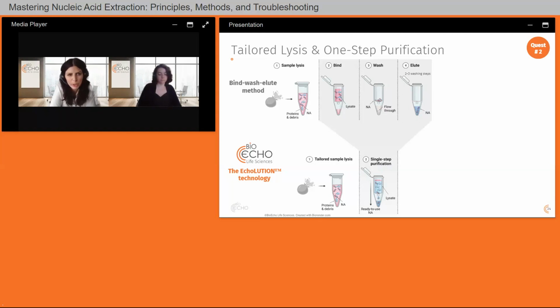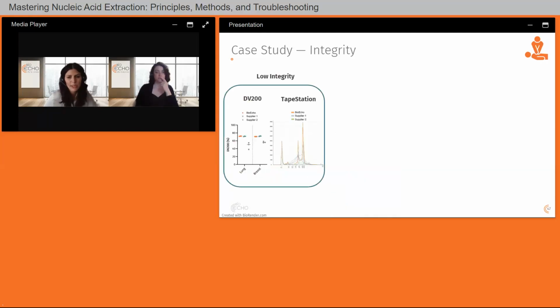Because usually people, when working with RNA, for instance, expect the textbook high RIN values. And I think that's not feasible with FFPE, because how the FFPE sample is handled completely ruins our RIN values, because it's cooked completely before embedding it in paraffin. So what you can focus on, and I touched on this briefly, is DV200 values. So the left graph here. It means not focusing on RIN, but checking on your TapeStation.